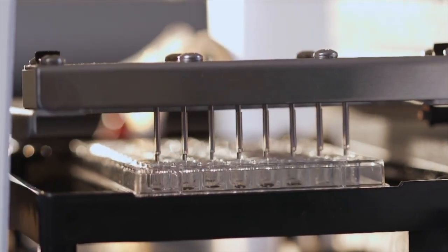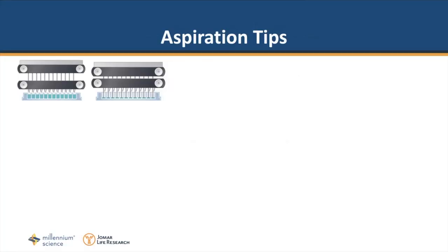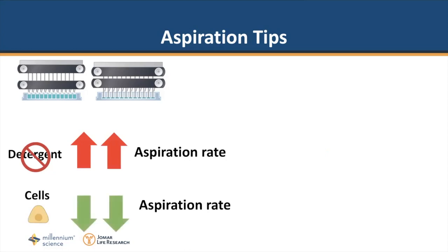Tip two centers on aspiration. Again, add a detergent to your wash buffer as this will make it easier to aspirate your wells. If you forego a detergent, you will need to increase your aspiration rate to help evacuate your well. For cell-based assays, I recommend reducing your aspiration rate to protect the monolayer integrity.